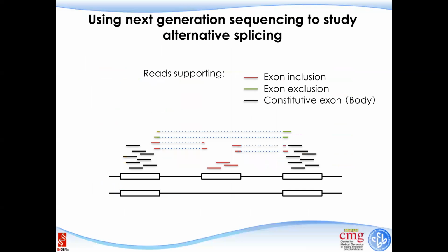So basically, as we have introduced through this course, with next generation sequencing technology, with RNA-seq, we have a new capability to study alternative splicing. Just for this example, there are three exons and 2 isoforms, and the reads just map to 1 exon. It's not informative to determine alternative splicing. It's named a constitutive exon, and the reads map to the constitutive exon.